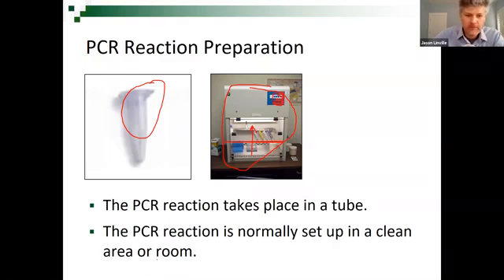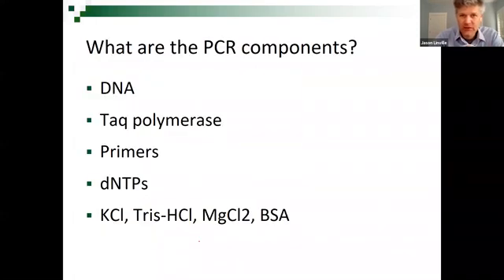The one thing important here is this PCR reaction is normally set up in an area separate from after the DNA is amplified. Because remember, we're not amplifying all of the DNA in the tube, just specific portions of it. For forensic science, it's those short tandem repeat areas. And once those areas are amplified, you have 10 million copies. If that amplified DNA gets back into the prep room, then only a very tiny amount of it can cause interference. So you have to be very careful to separate your preparation area from your samples after they're amplified. And usually that's done physically in a different room.